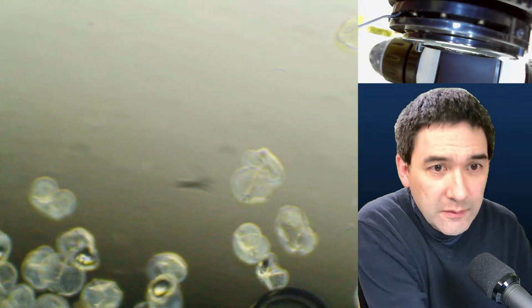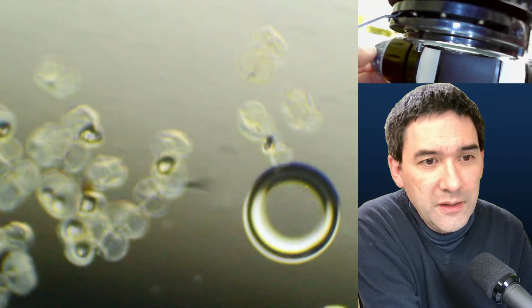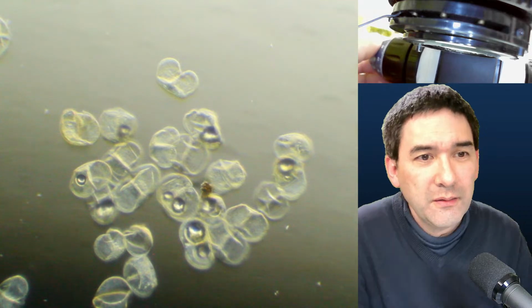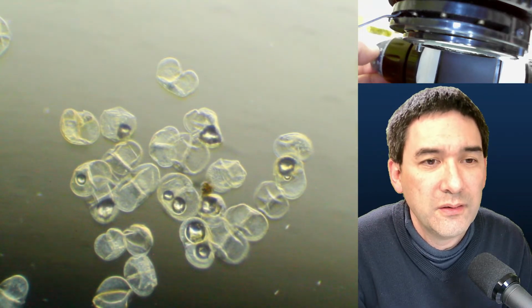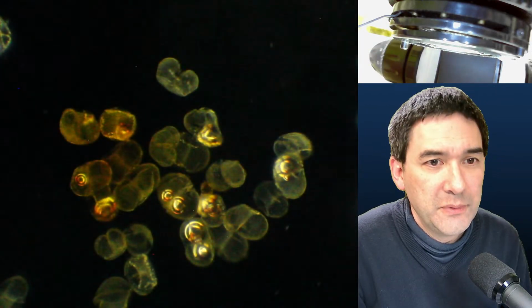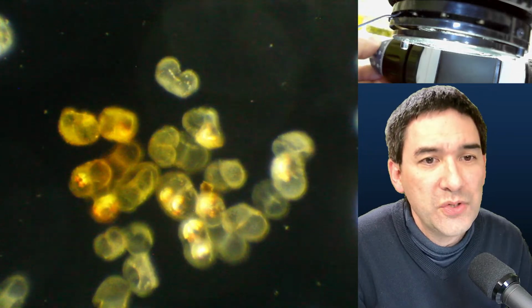Okay, so there was U-Kit, and we can see that it looks very different. So let's go to Euparal. And again we are able to see that here. Let's focus again. You see that here the 3D effect is a little bit stronger, I think. So let's close it and turn up the light. I have to turn up the light quite a bit in order to see it.